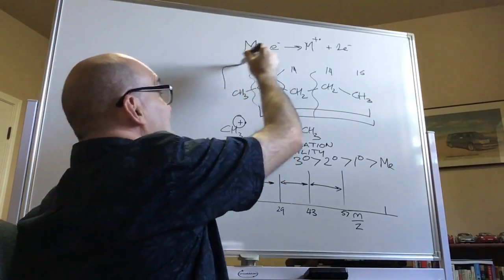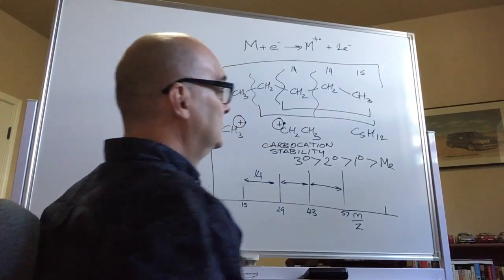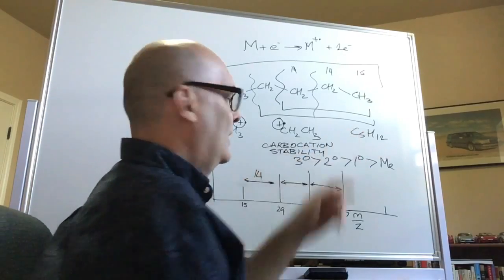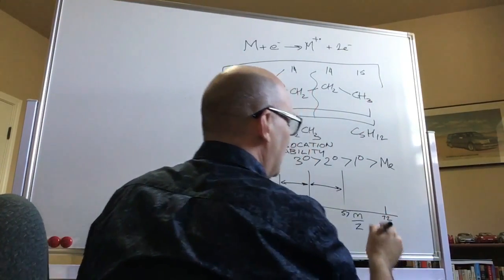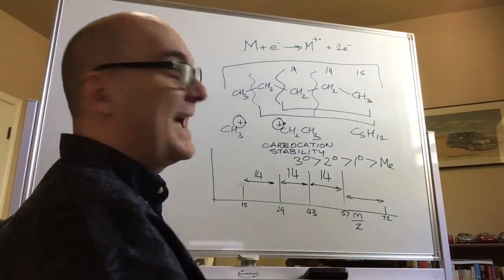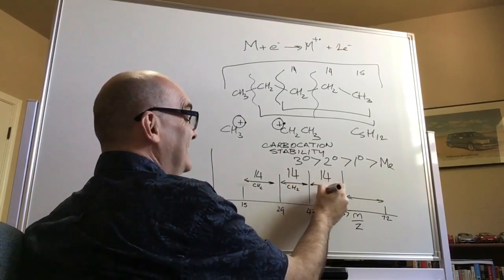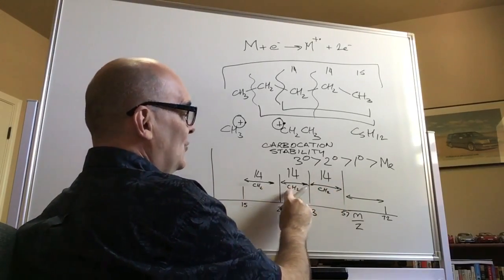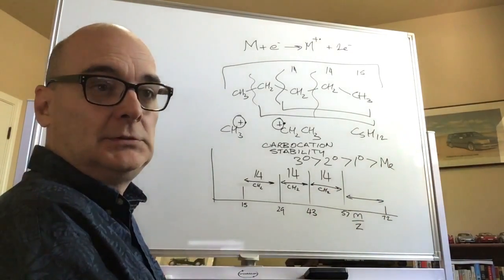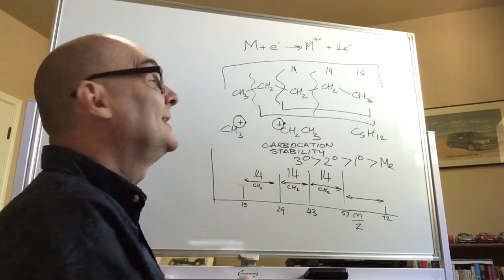And then the molecular ion. How heavy is C5H12? 5 12s are 60 plus 12 ones, 72. Okay. This is an alkane. I'm seeing, or should be expecting to see, CH2 fragmentation coming off that molecule in chunks. What's a CH2 called? Methylene. Yeah.